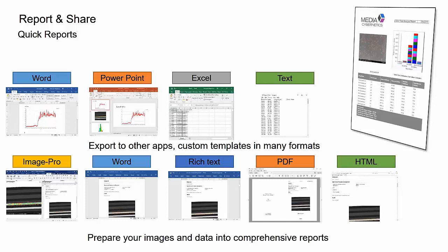There are customizable templates. So essentially you can import all the data, generate the data, analyze it, measure it, and then click a button to lay everything out into a proper format quite easily using this software. Especially when dealing with multiple data sets or large data sets, it gets pretty challenging in order to summarize all of that information into one page. And the quick reports really do help in order to tabulate that information.